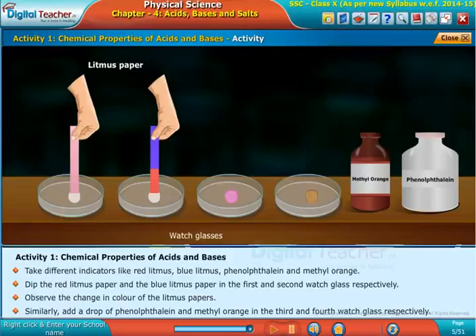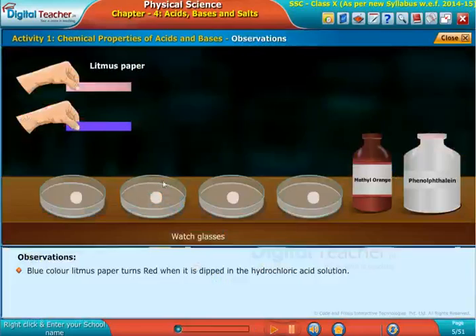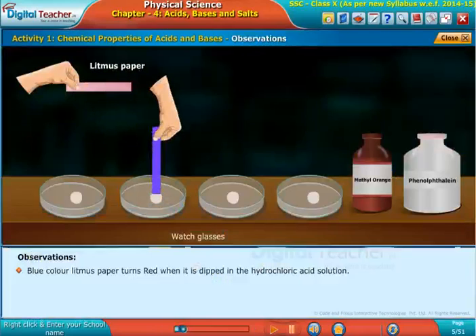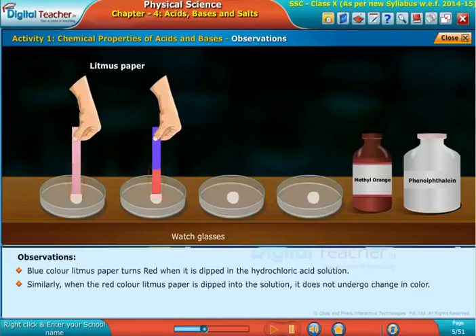Blue color litmus paper turns red when it is dipped in the hydrochloric acid solution. Similarly, when the red color litmus paper is dipped into the solution, it does not undergo change in color.